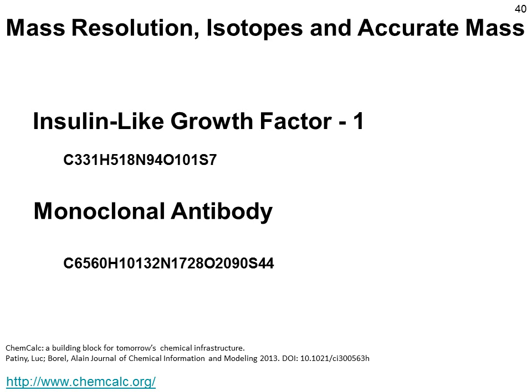Let's look at two examples showing why resolution is so important, especially for the analysis of macromolecules. Here we have two proteins, a biomarker, insulin-like growth factor 1, which is related to growth hormone-related disorders, and a monoclonal antibody, the most important class of biotherapeutics to date. Insulin-like growth factor contains 331 carbon atoms, 518 hydrogen, 94 nitrogen, 101 oxygen and 7 sulfurs.